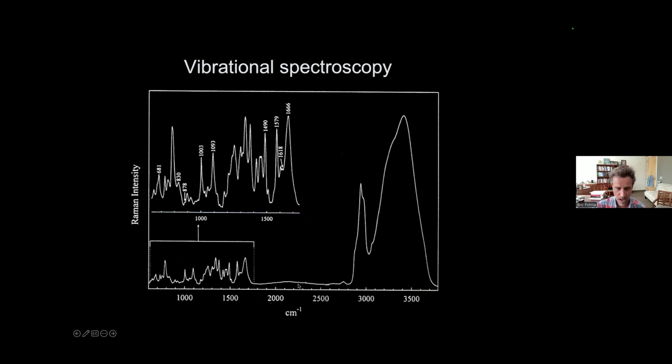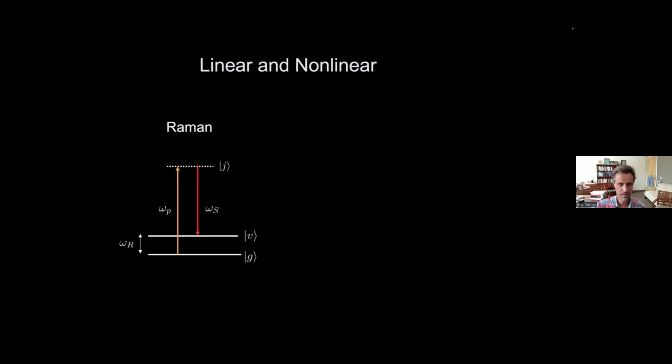And then you have nothing here for a long time. Okay, so there's really no response between this high energy range and then this other energy range where there's lots of little tiny peaks that tell a detailed story about which molecules contribute. So every peak here corresponds to a particular vibrational mode of particular molecules. Okay, so it's your task to figure out what's going on. But if you're good at this, then you can use it to your advantage and basically target specific molecules based on their specific vibrational fingerprints. That is a general idea.